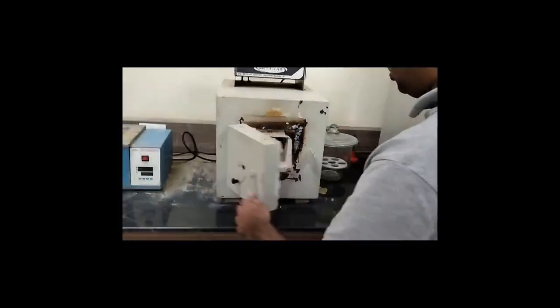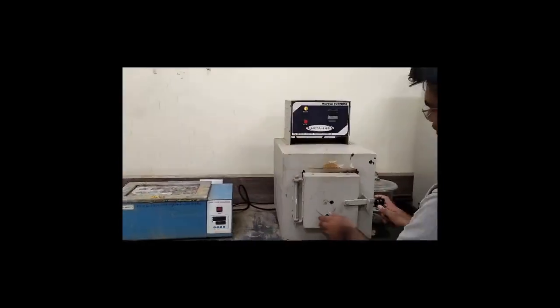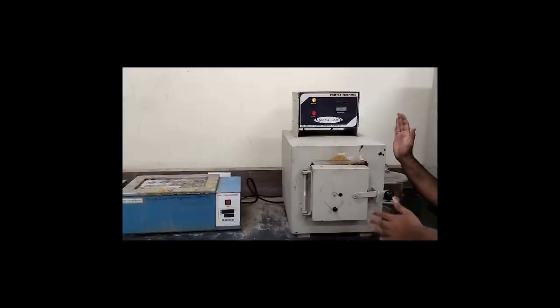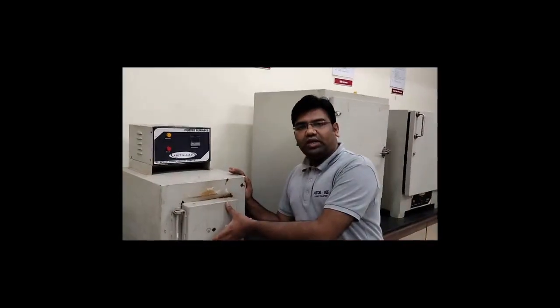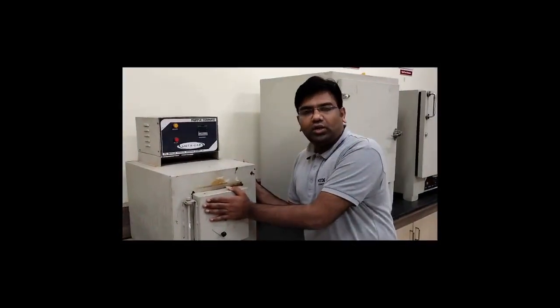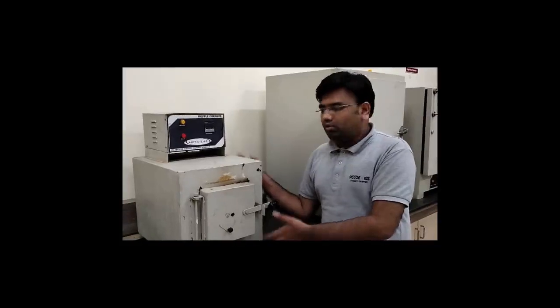So we are going to close this door, and we have to keep this notch open so that the required amount of oxygen goes inside. Once we start this, we don't need to open this door. If we open this door, what will happen? There will be excess oxygen supplied, and inside this muffle furnace there will be flames. Now we have to do the control. This is called the controlled burning process, where the temperature is high. If we open the door midway, it will happen in an uncontrolled manner. You can see a lot of flames.